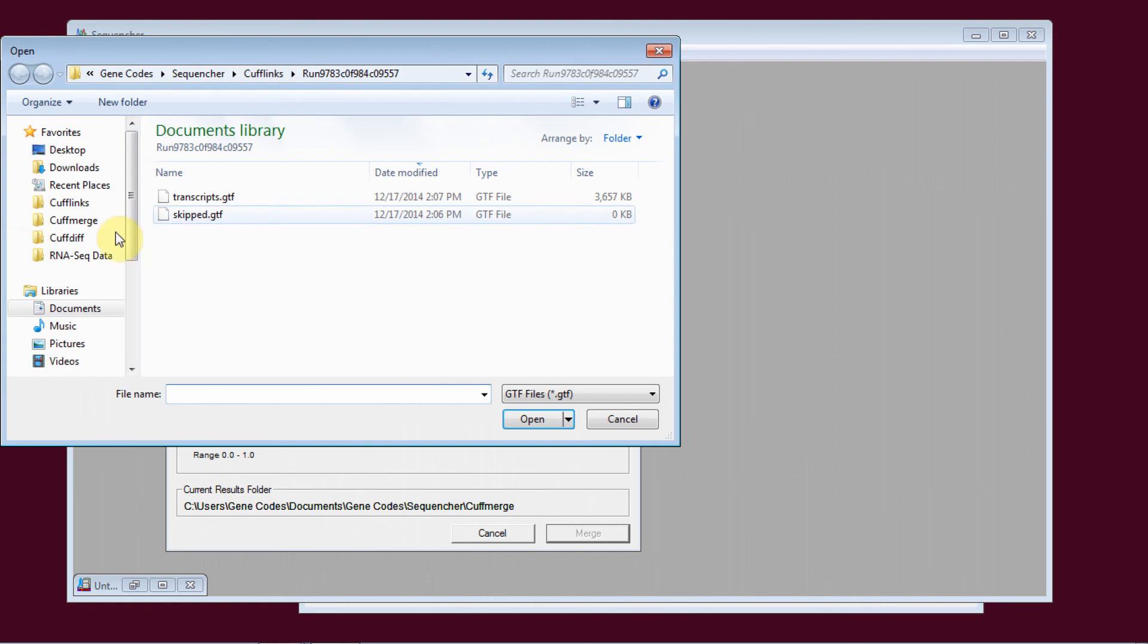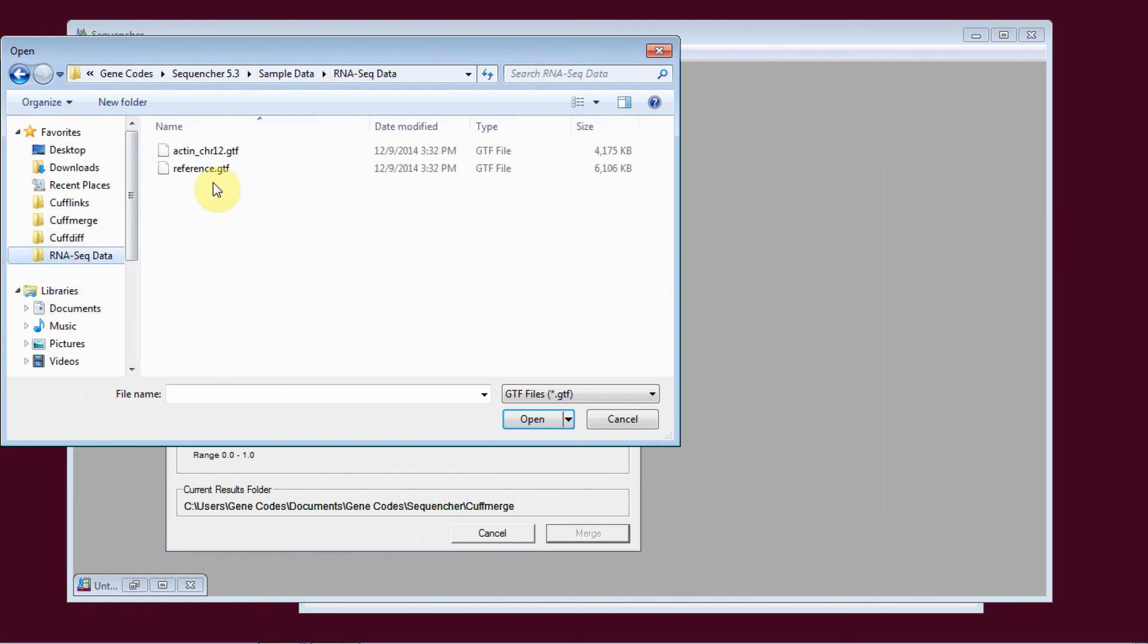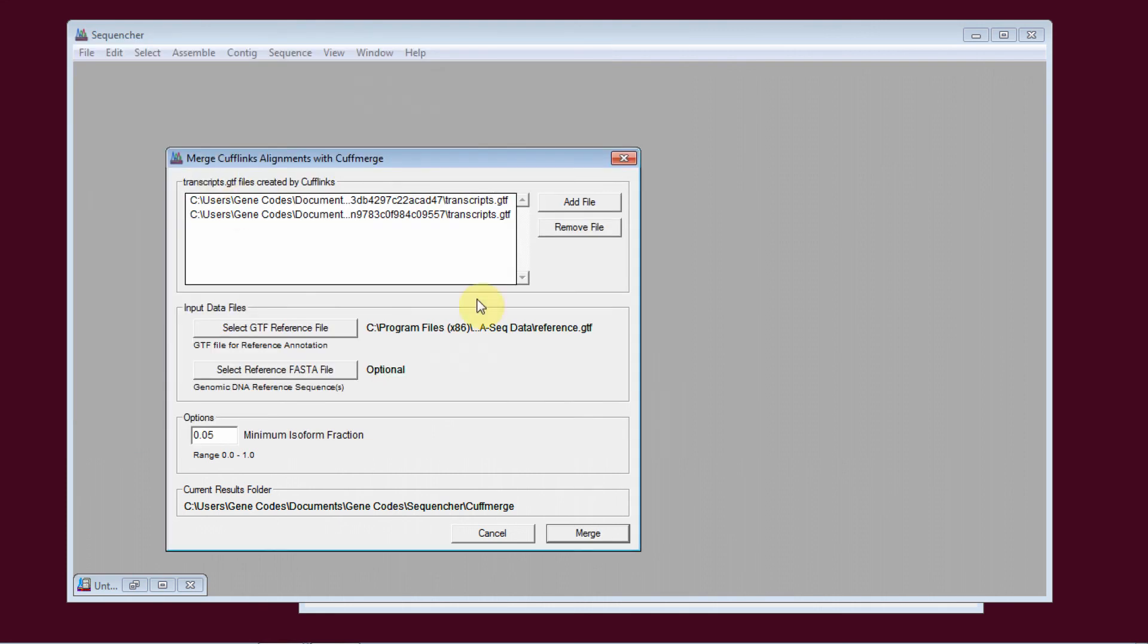And select a reference file. And then I select Merge.